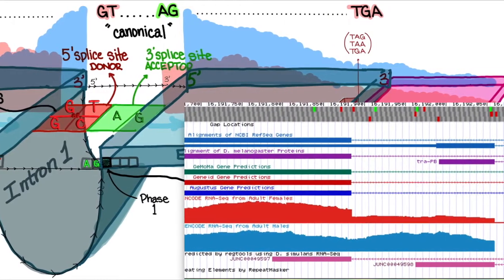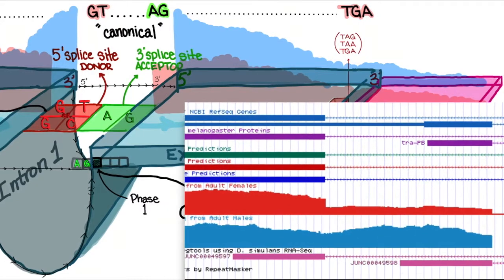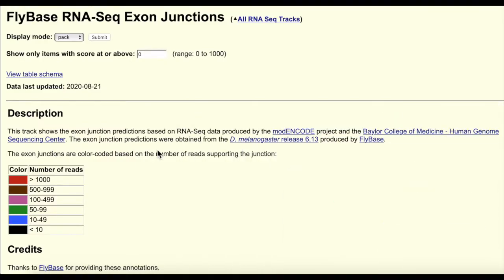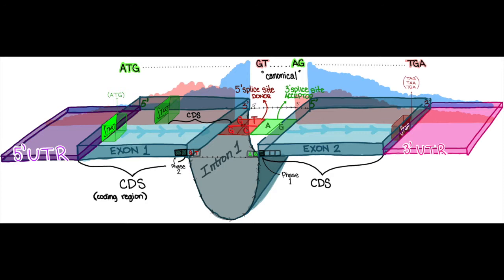When it looks like the drop overlaps other reads that are expressed equally less or more abundantly, this could potentially be where isoforms differ. Depending on your assembly, you may be given a track useful for identifying possible alternative spliced junctions, labeled something like spliced junctions, intron-exon junctions, TopHat, Bowtie, StringTie, Cufflinks, or others. The overall idea is that these will highlight areas where the reads line up to a discontinuity in the alignment, using a track color-coded according to the key provided in the track configuration page.